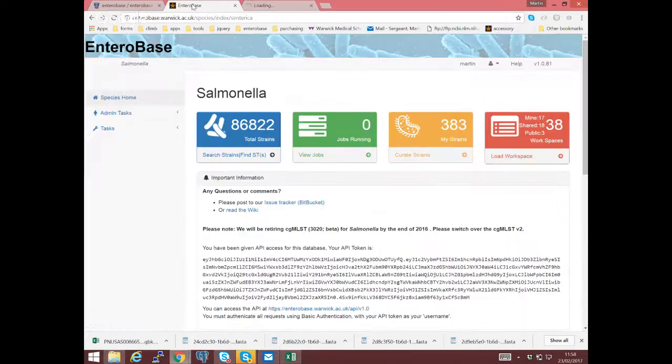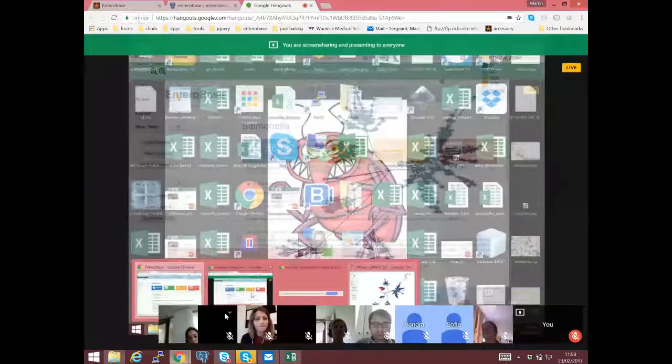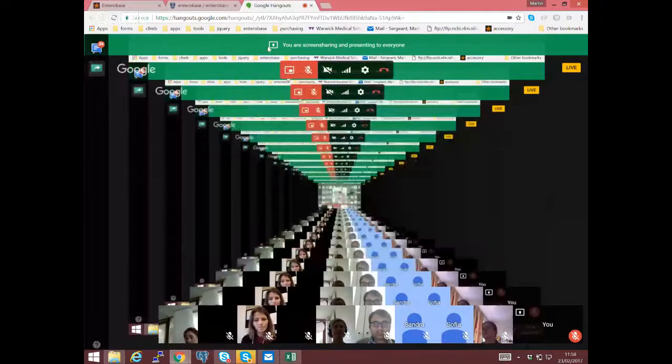Do you want to explain, in the meantime, how to create an Uber strain? Okay. Do you want to do that, Nabil, while I try and sort this out? Okay, so I'll stop sharing my screen. Have I stopped sharing it now? Yeah. Okay, I'll just switch over to mine.